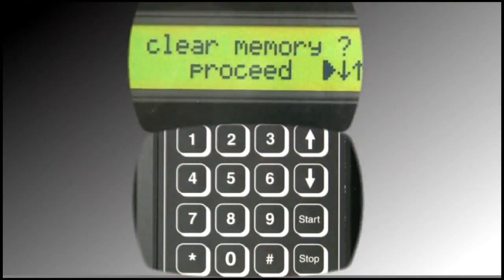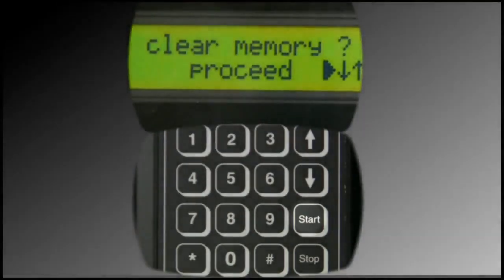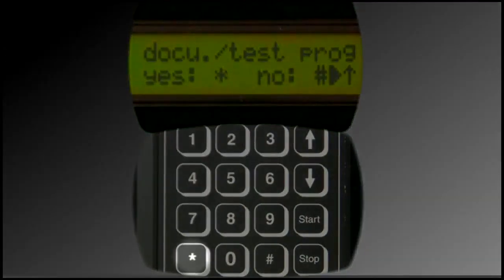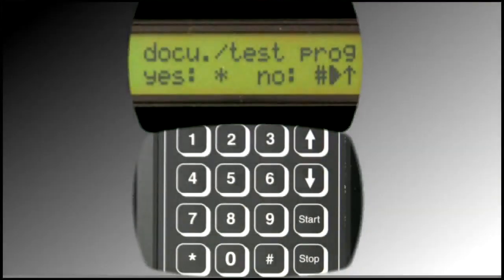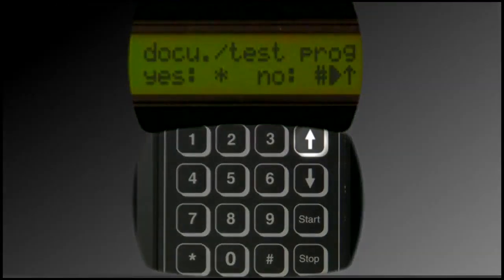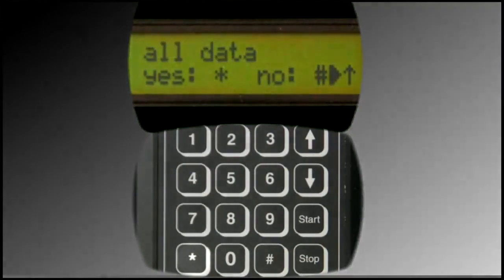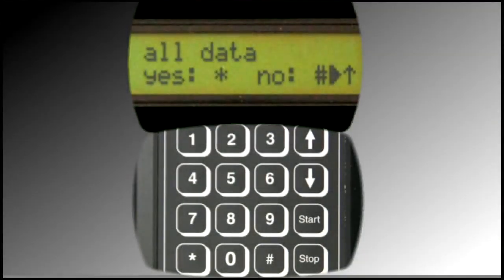No new test programs can be entered until all test data and test programs are cleared from the device. There are two options in this menu. Press Start to view the first option. If desired, press the Star button to clear all stored test results and test programs from the device. Alternatively, press the Up arrow. If desired, press the Star button to clear everything from the device, including calibration information. It is strongly advised this option not be enacted unless one is certain they would like to have the device recalibrated.